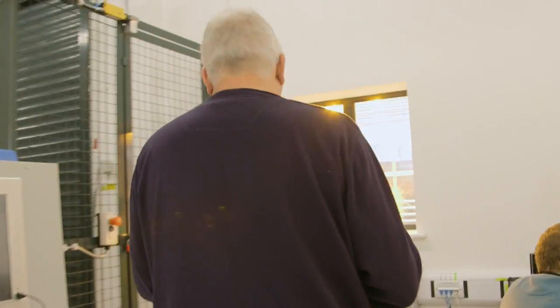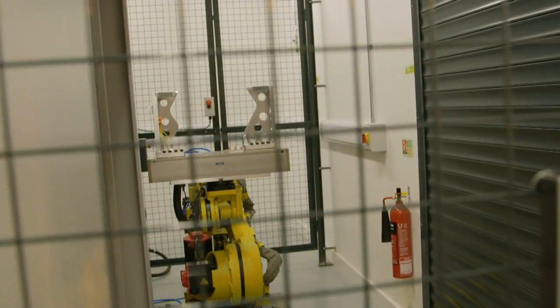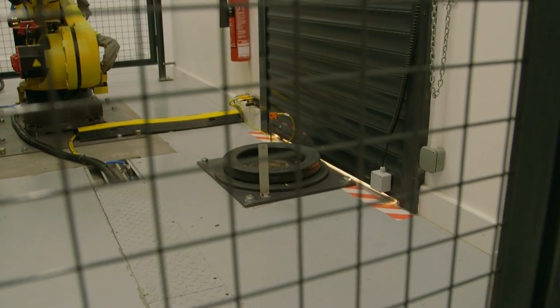A metre long sample can be something like 80 to 90 kilograms in weight, so we don't want people carrying those around and we particularly don't want people dropping those into our scanner. So they're put in automatically. Through here you can see a large FANUC arm, and the way the facility works is the samples are dropped into the circular ring on the floor there. The arm picks them up and loads them into the scanner.